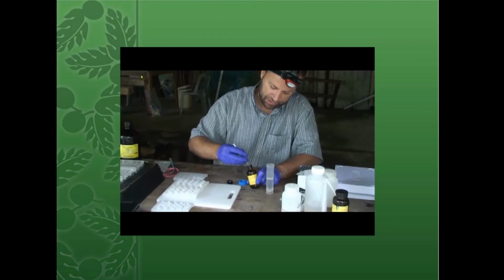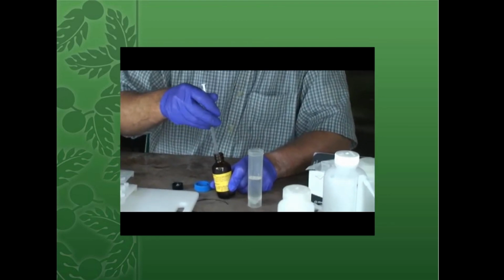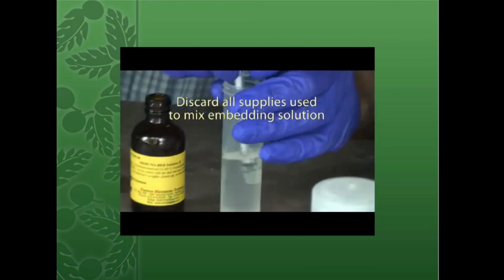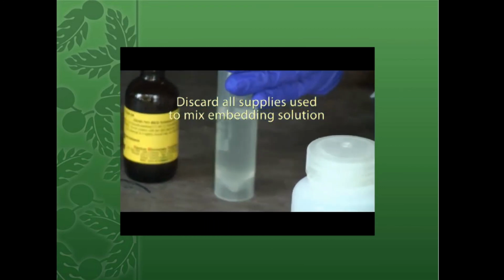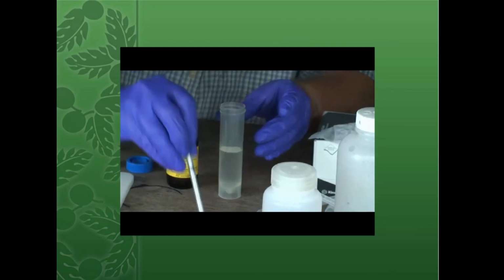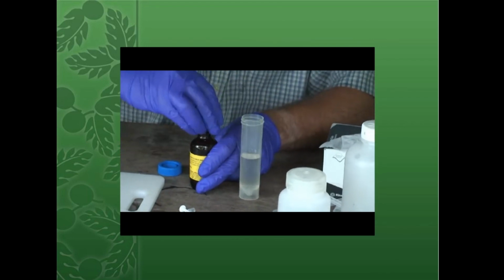So we're using 1 cc tuberculin syringes, adding that in there, and we're not going to reuse these syringes because this stuff tends to melt rubber. So we just put it in there and then wash that out, set that aside, close up the bottle.